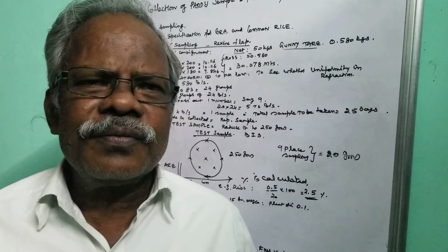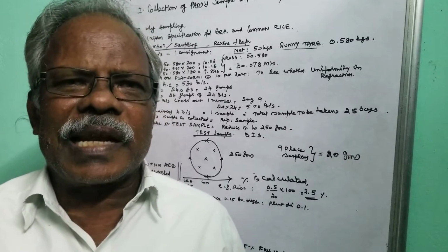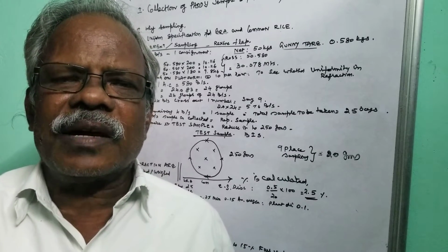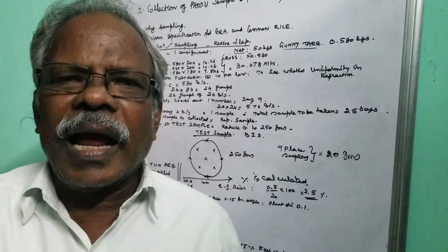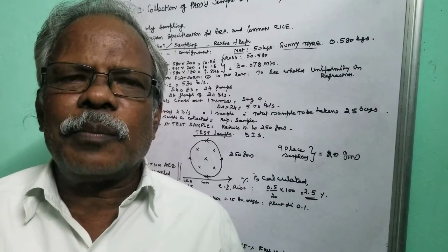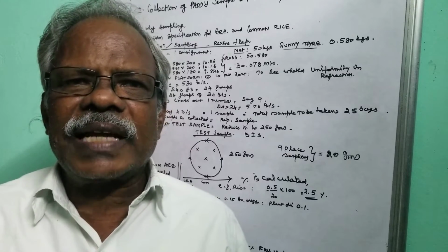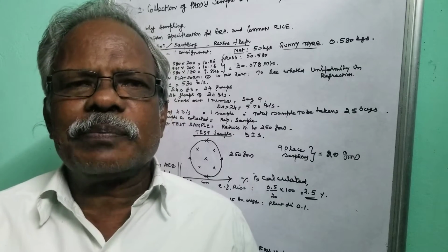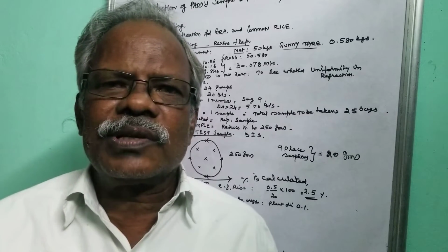Today in this video we are going to discuss the analysis of food grains, particularly rice, in the Food Corporation of India. We are going to see how the analysis of food grains, particularly rice, is taken up before procurement and during storage. How the sample is taken, and then from that the test sample is taken and the refractions are removed and the percentage is arrived at. Based on the percentage of refractions, the procurement is done, that we are going to see.